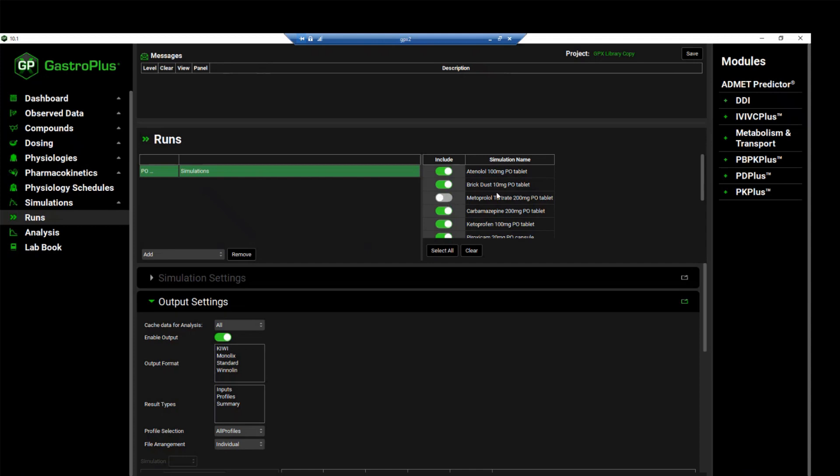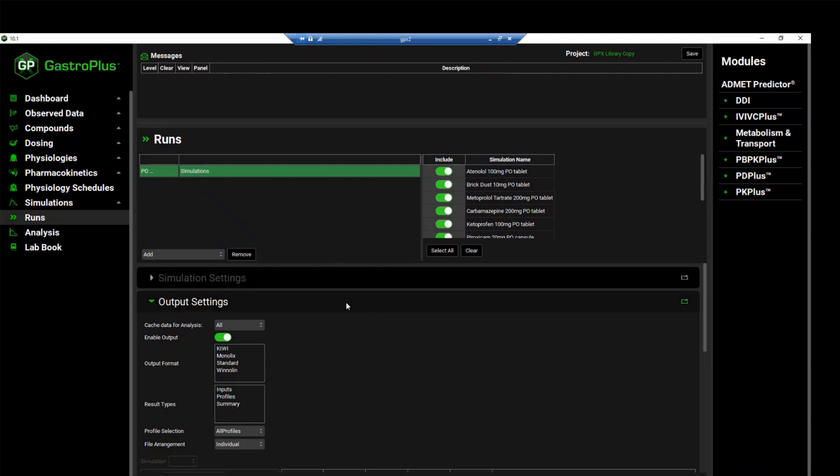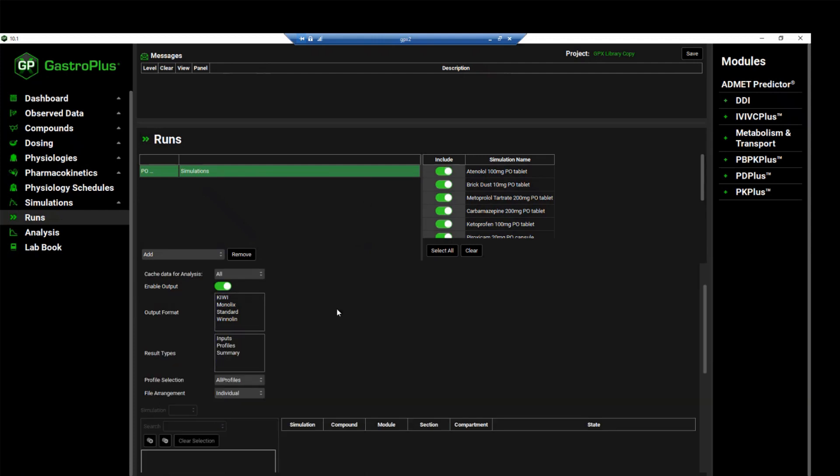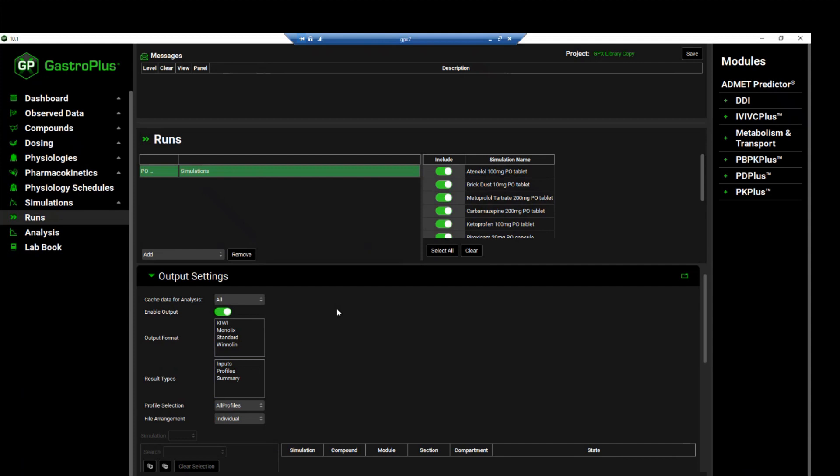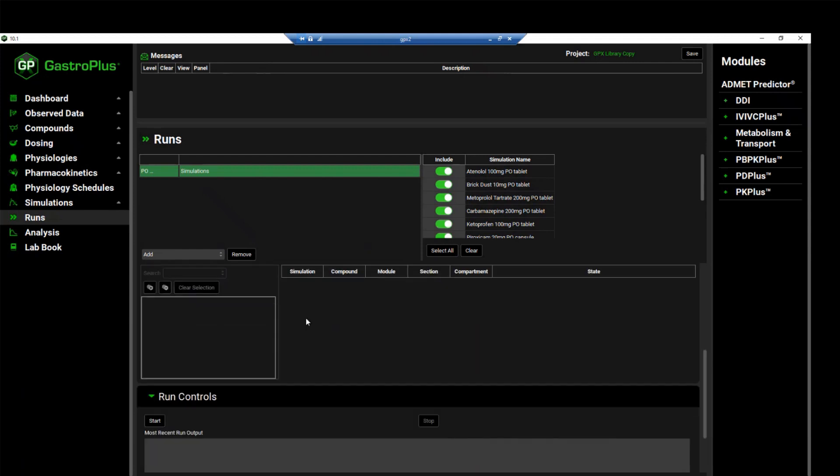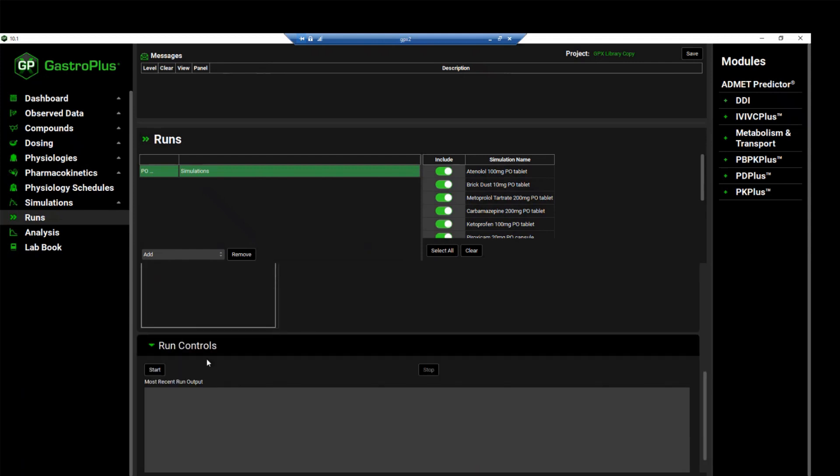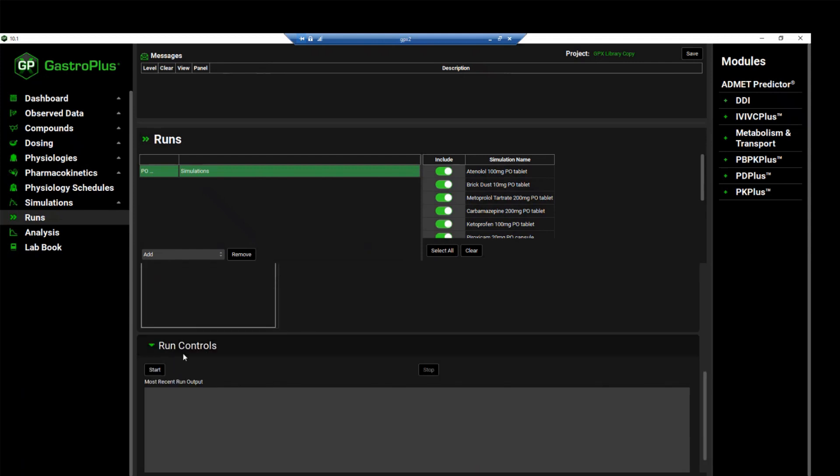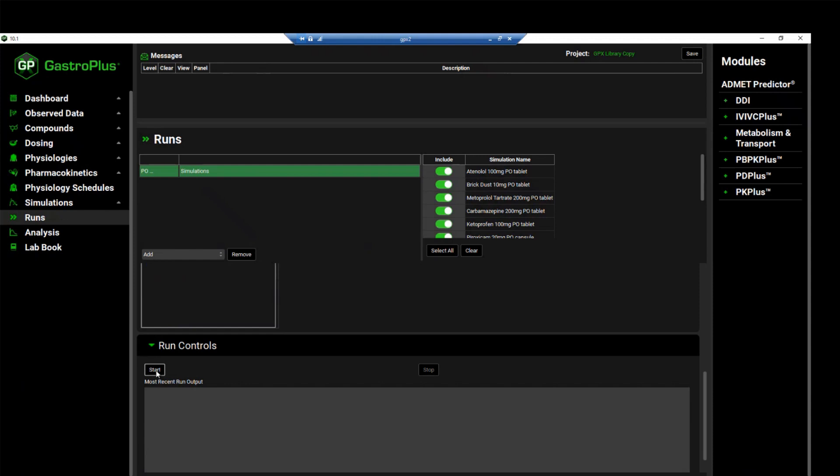indicating that this simulation will not be included in the run. I will click this toggle back on because we want to run a run with all simulations included. We are now ready to run the simulation. Scroll past the output settings panel to the run controls panel and click start.